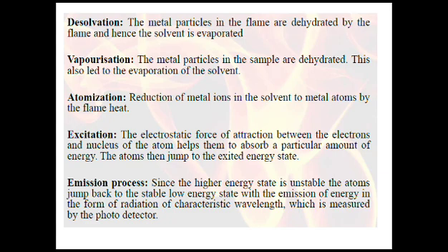Desolvation. The metal particles in the flame are dehydrated by the flame and hence the solvent is evaporated. Vaporization. The metal particles in the sample are dehydrated. This also leads to evaporation of the solvent. Then atomization, reduction of metal ions in the solvent to metal atoms by the flame heat.